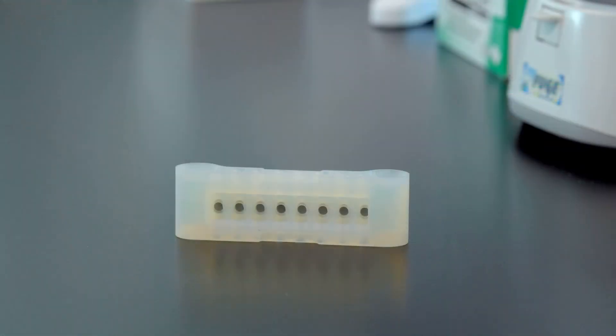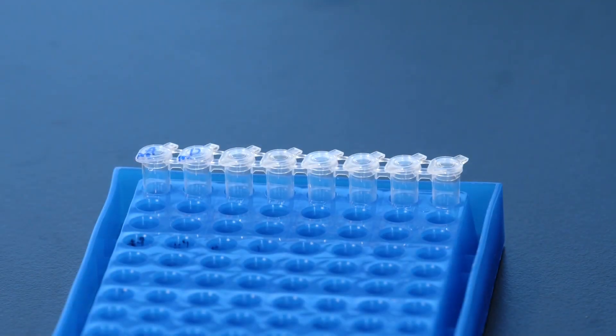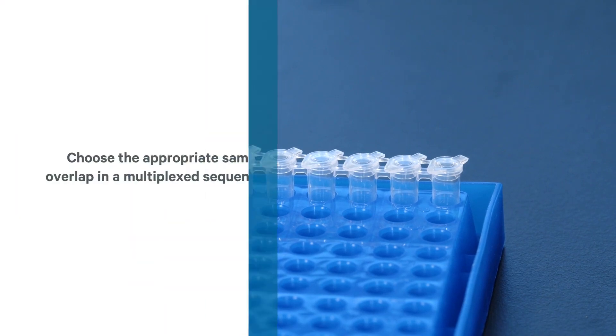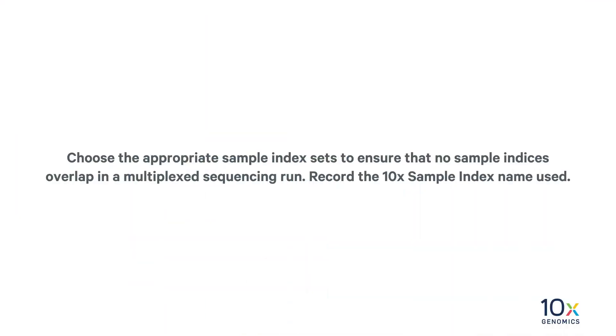We have a 10x magnetic separator and the samples in an eight-tube strip. Choose the appropriate sample index sets to ensure that no sample indices overlap in a multiplexed sequencing run. Record the 10x sample index name used.